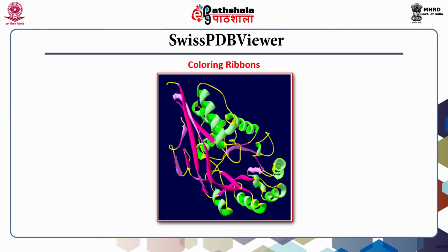This coloring does not reveal a real 3D view, but only a pseudo 3D view. From this image, we can make out front and back of the molecule, but we cannot think of or measure or appreciate the exact depth. In this image, we are not able to see the depth of the molecule. Therefore, we are not able to make out whether a particular amino acid is on the front side or on the back side or in between of the molecule.